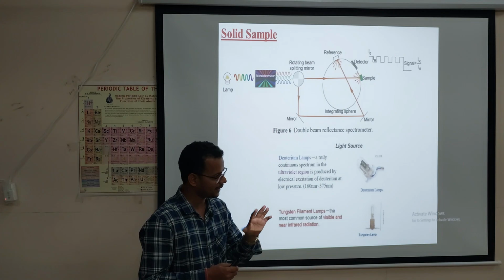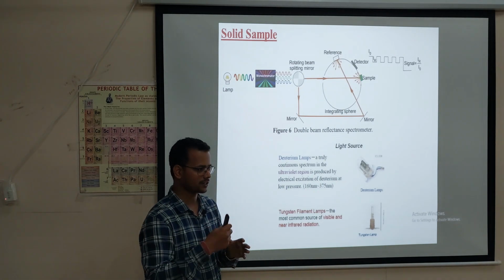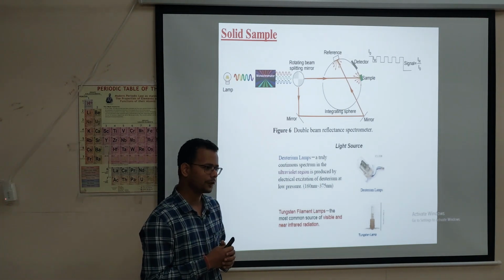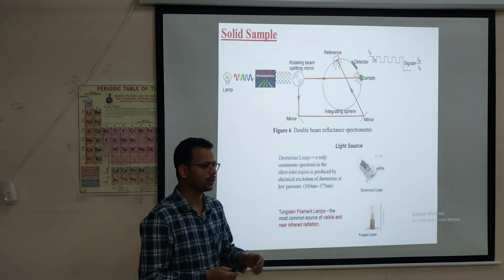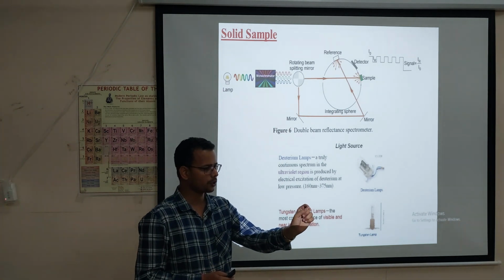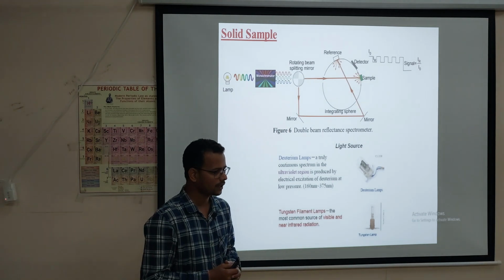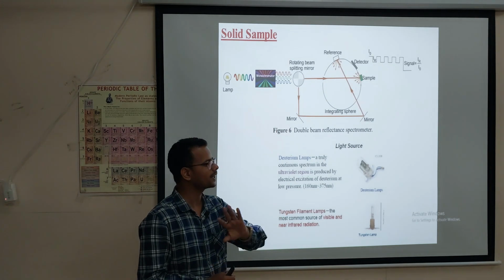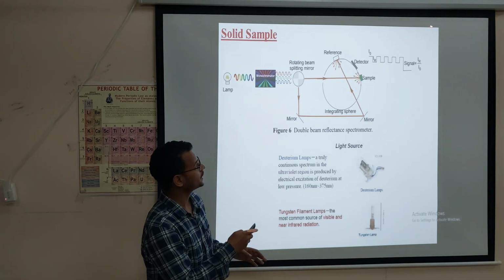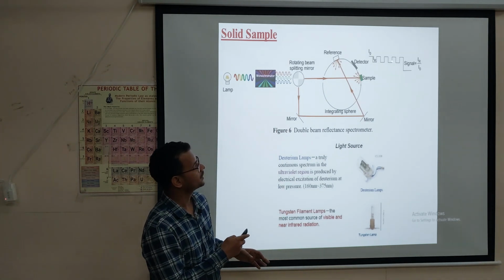Graph directly in the instrument. It will convert the data into a graph. But in liquid sample analysis, we will get only a concentration value like 0.056 or 0.089. Then we have to calculate manually. In that case, we will not get any graph. So here we have shown only a graph type structure.